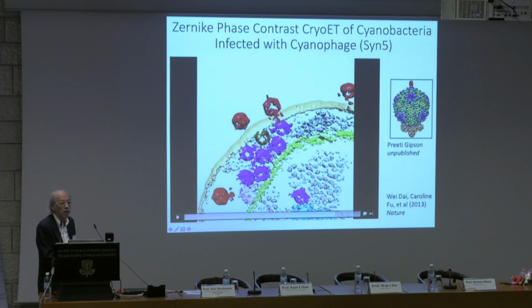They not only have a tail, but at the opposite vertex they also have a protruding density we call a horn. So one of the questions is, does this horn have anything to do with the infection? But by looking at this picture, we say no, because the tail is still doing what the tail does, which is penetrate through the cell wall. The horn is sticking out on the other side. So that suggests the horn must be involved in a different kind of biological function.